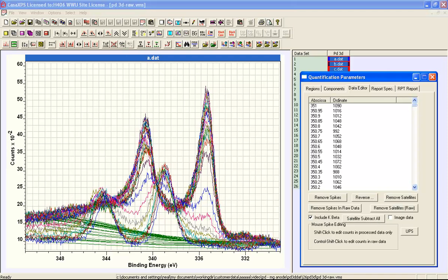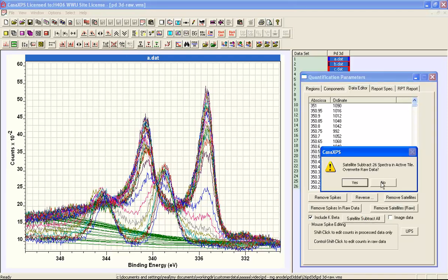That are overlaid in the active tile. So when I press this button I get a dialog window that says do you want to subtract the satellites from the 26 spectra in the active tile. That's referring to these spectra here.